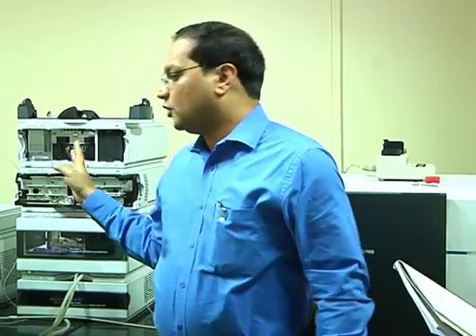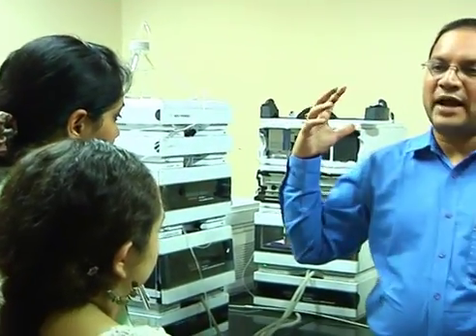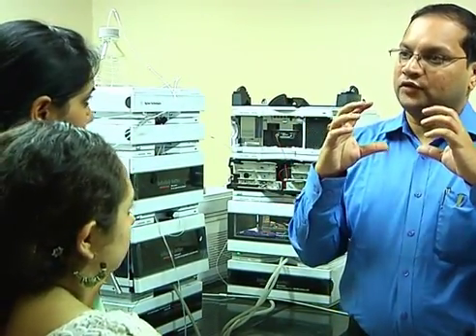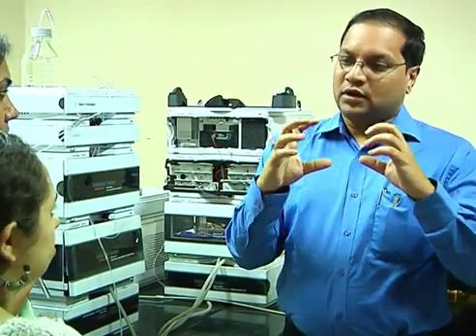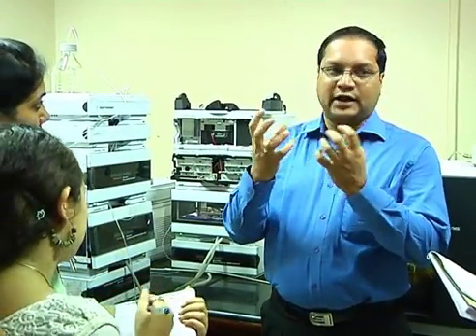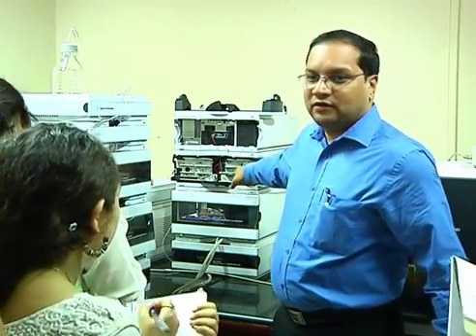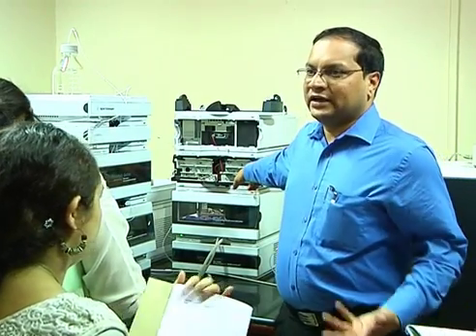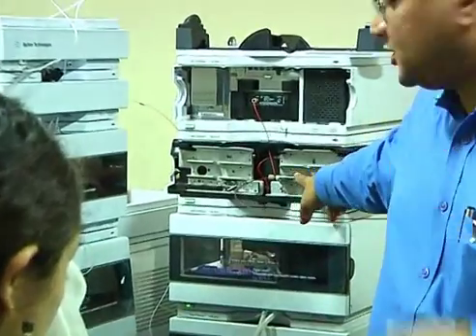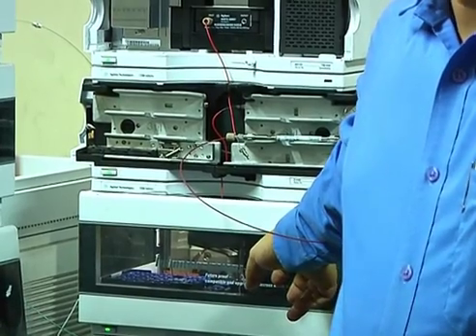So as an HPLC, if you see the configuration, the HPLC is basically a separating device. There is a module called the pump, a binary pump, typically two pumps. What is the purpose of two pumps? To pump the mobile phase. And typically what type of mobile phase do we use? In the case of peptides, it is hydrophobic interaction. Based on hydrophobicity, it will bind to the stationary phase, and then you elute by changing the polarity. We have the pump, then we have a column compartment where you put the column. Typically, it's heated, so you can have better separation. Then you have an autosampler. If you recollect my slide, I said it can be automated.